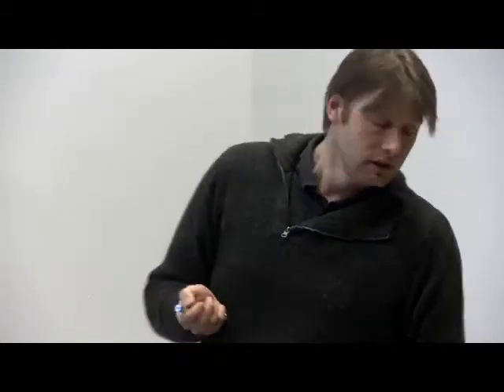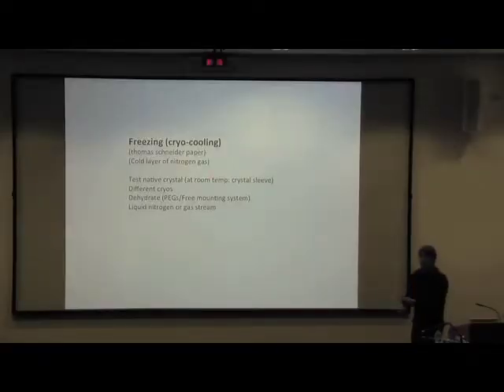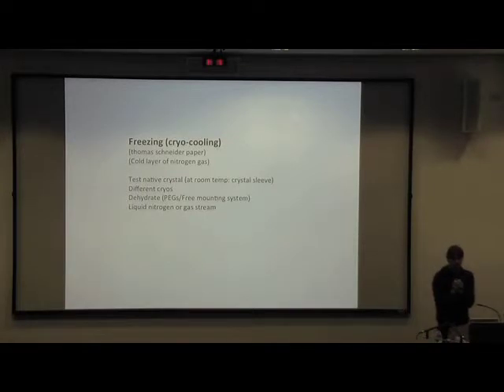Now, another good thing is, it's really a shame, we typically freeze them, and the reason is that the intensity of the X-rays that we shoot the crystals with at the synchrotron is so high that you would just destroy your crystal after 1 or 2 images. So we need to cryo-cool the crystals. But during the process, you might well mess up the quality of the protein, and there are different reasons for it.